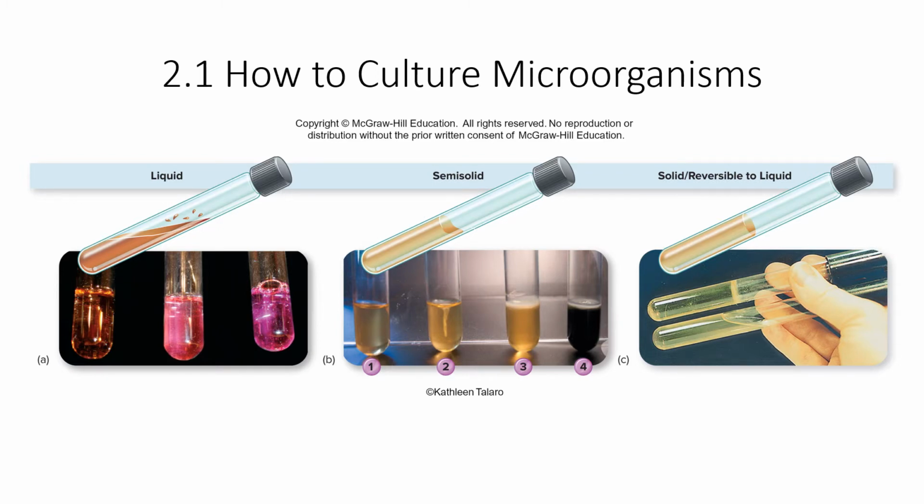So when you look at liquid to the left, it's just water. It's water with certain nutrients, certain dyes, certain pH markers. Turns out we like colors in microbiology. We're going to add in a certain dye, a certain compound that starts one color, and as the bacteria grow and metabolize something, it changes colors. Goes from red to yellow, green to blue. It's easy to tell these differences.